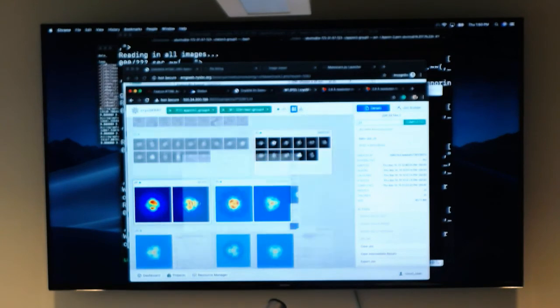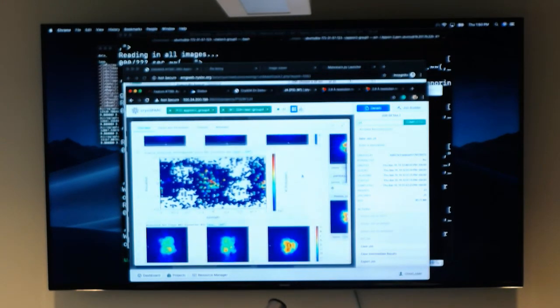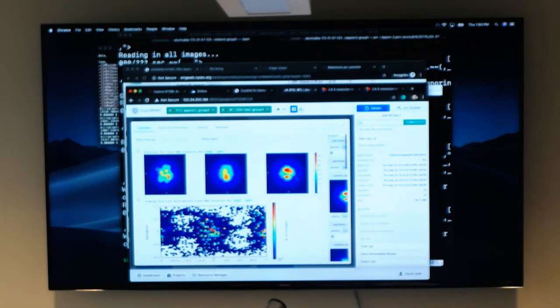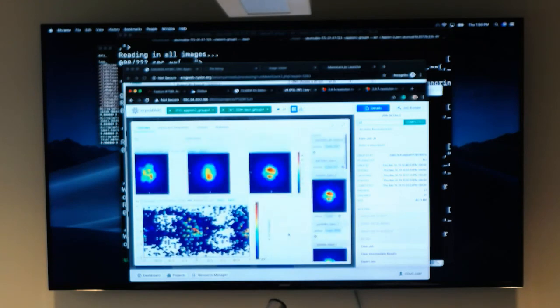They chose 2 classes. Were you able to download these 2? Did you look at them? It's in Chimera, so you clearly saw one was better than the other. You can sort of visually see that here. But sometimes, if you specify too many classes, say you want ab initio with 85 classes, one class will have the bulk of the particles, and other classes might only be populated by like 50 or 2 particles. Then, of course, the reconstruction is not as good, but that could be an artificial separation.